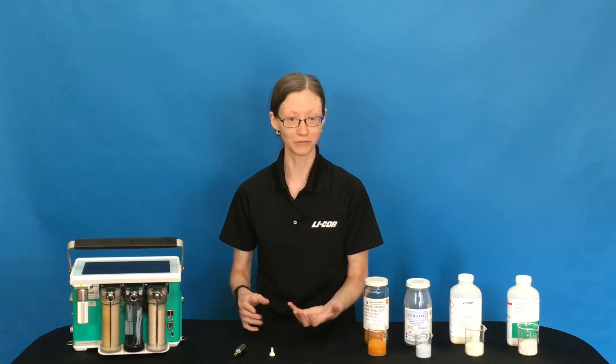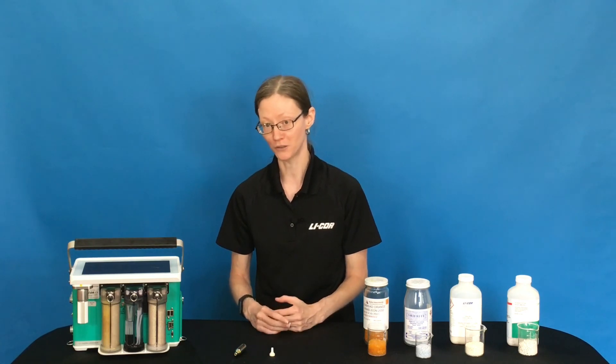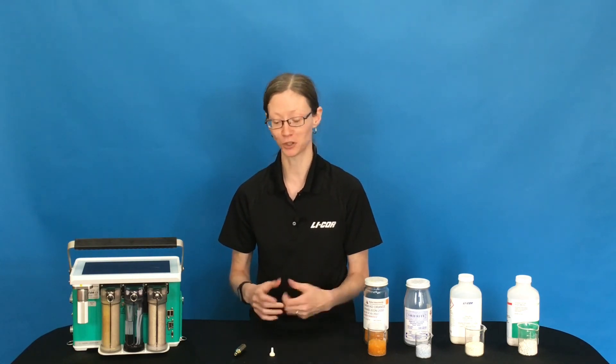So that's a quick introduction to some of the chemical options and their purposes in your LI-6800. If you have any questions, you can always check our manual or the website. And if the manual or website doesn't answer your question, please feel free to contact support or your local distributor and we'll be happy to help you.